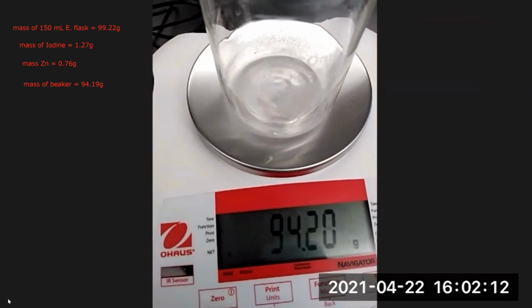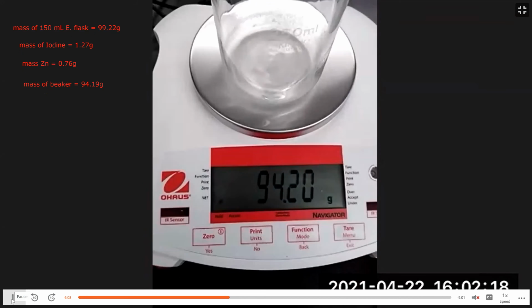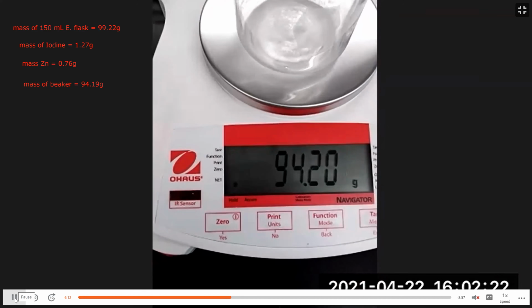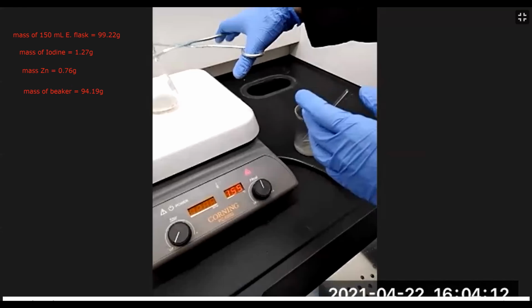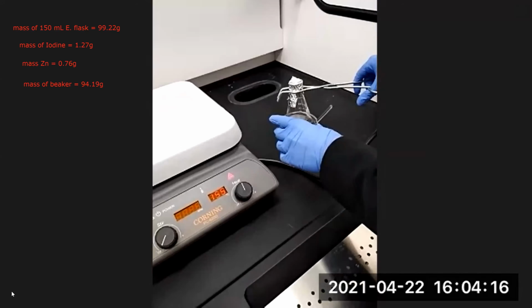Now we're going to take this beaker, pour the methanol solution into it, and then evaporate off the methanol and get our product. So here we are pouring the solution into the beaker.